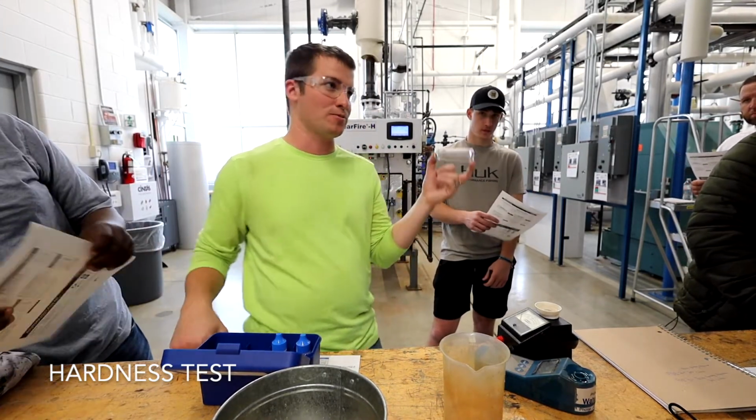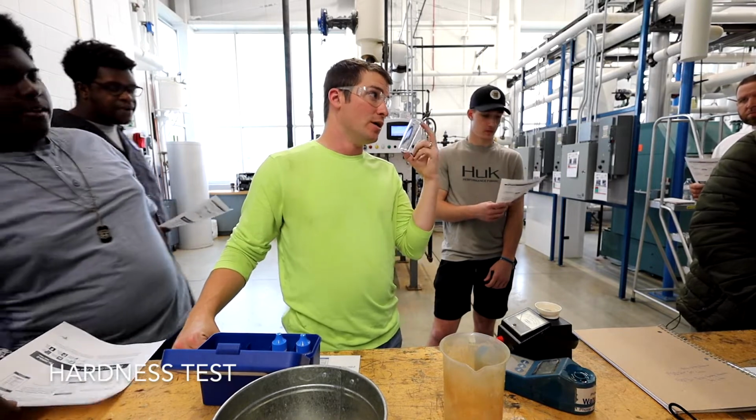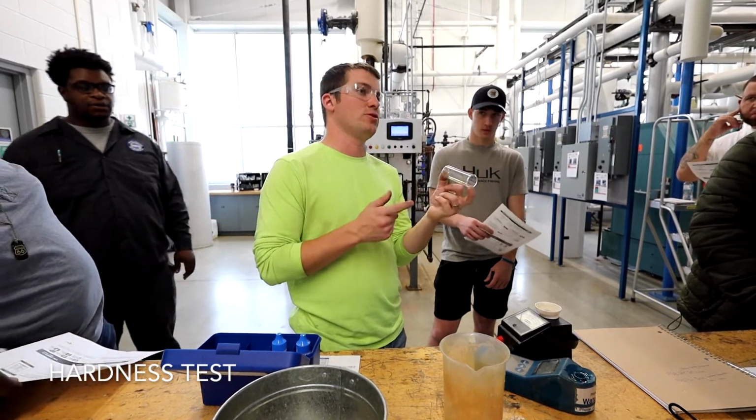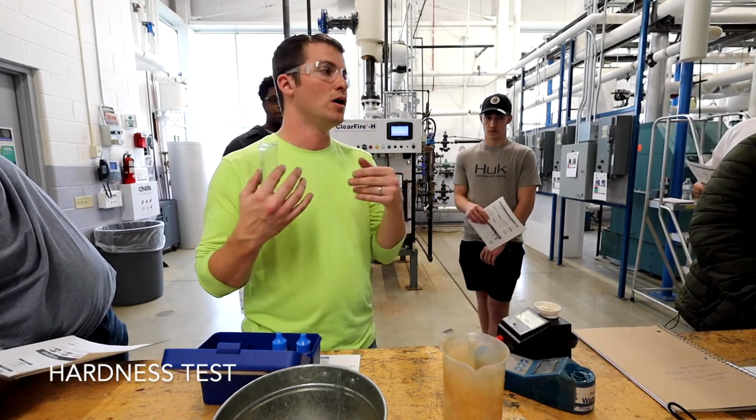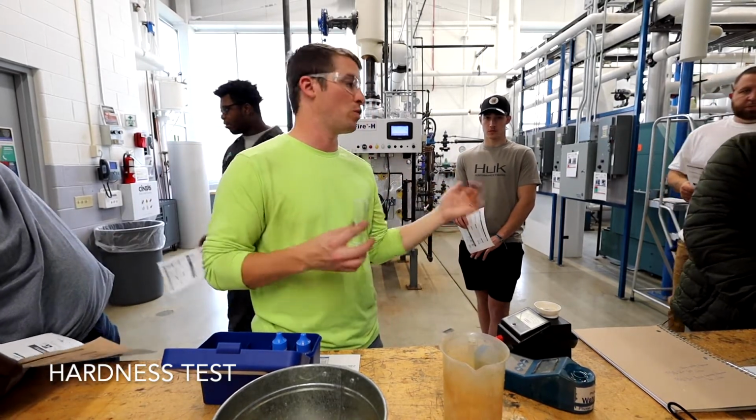So this is a brand new cup, so I'm not going to rinse it 3 times, but the reason you want to do that is because as you start to use it, if there's any potential residual, you just want to make sure that that's not going to give you a false answer, right? It's going to skew it one way or the other.